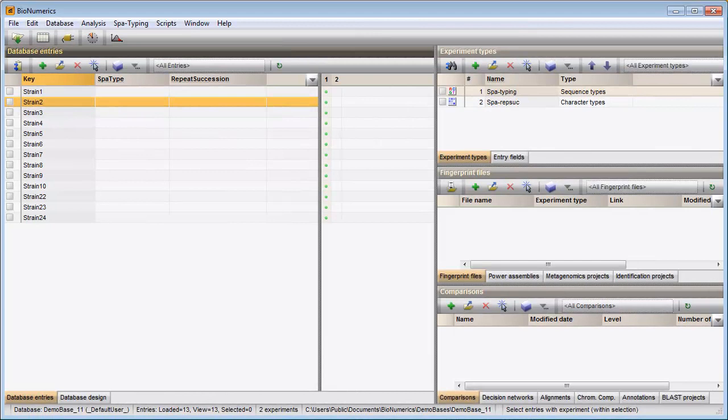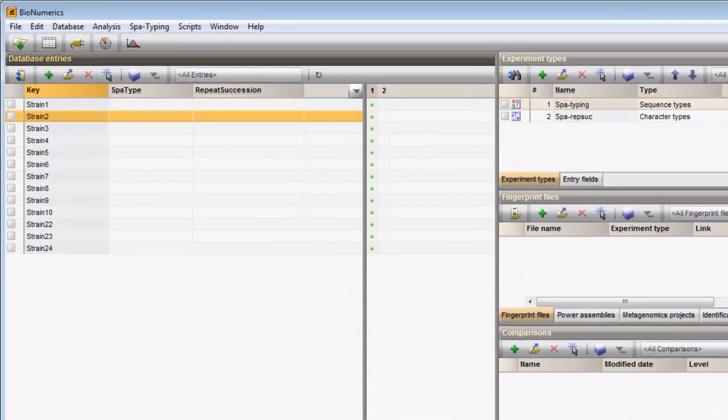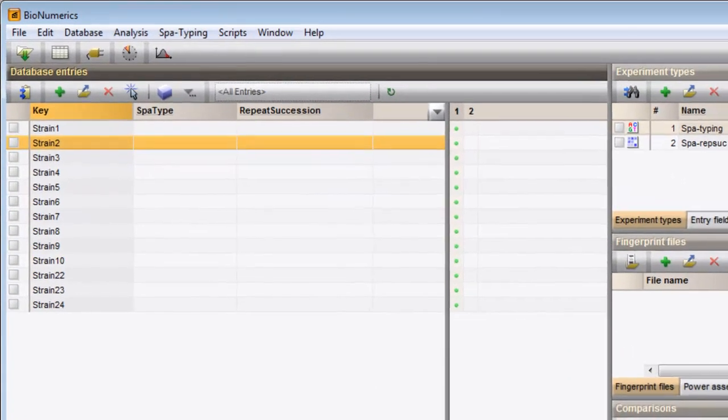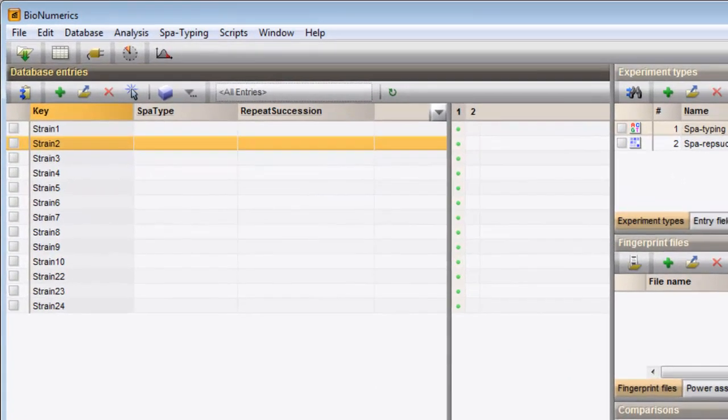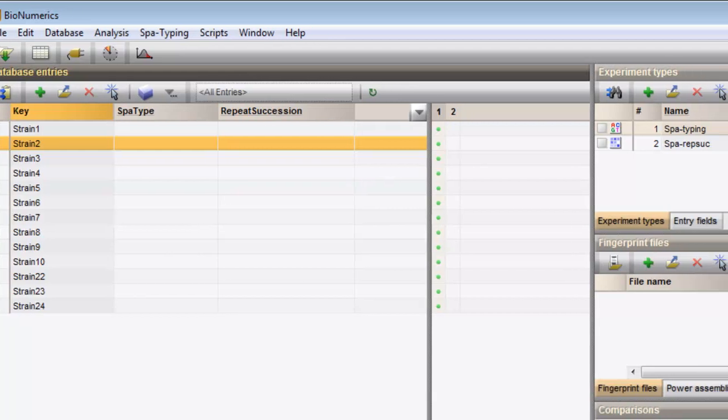In this video I will demonstrate how to assign spot types to your imported sequences. My entries are displayed in the Database entries panel. This panel is located on the left-hand side in the main window.